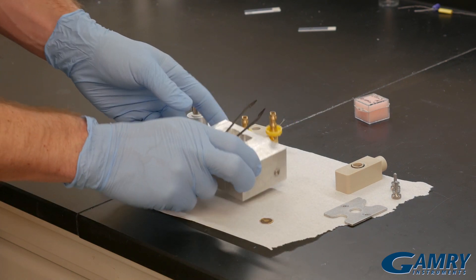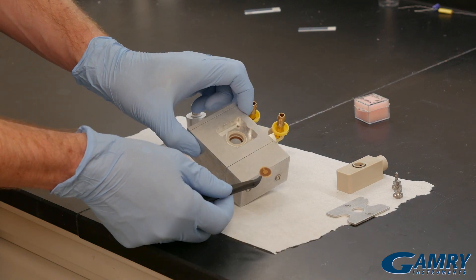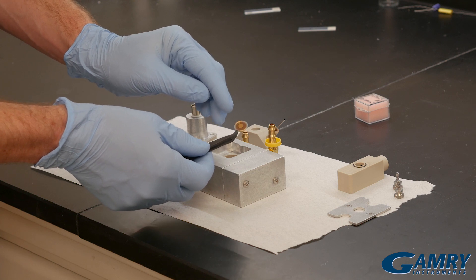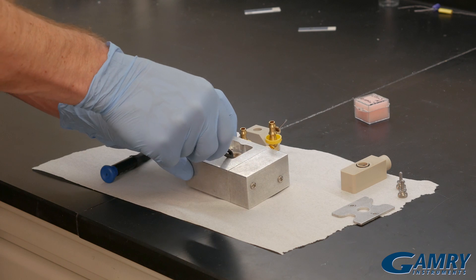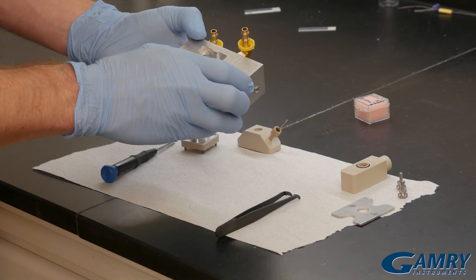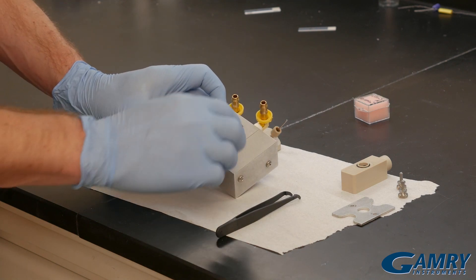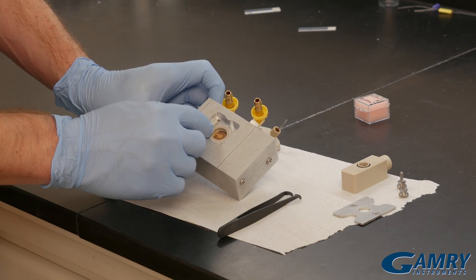We first start with picking up our quartz crystal and placing it in the back of our cell, making sure to place the keyhole configuration in the nine o'clock position. So I drop the crystal in there, making sure that the keyhole configuration is in the nine o'clock position.